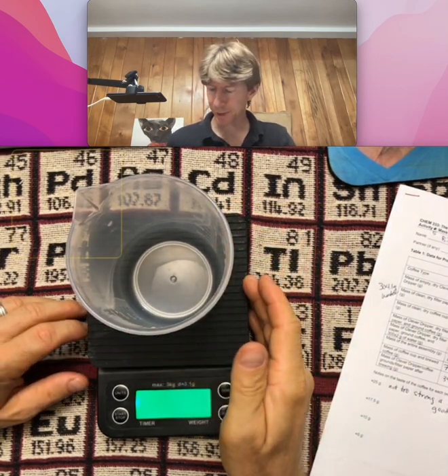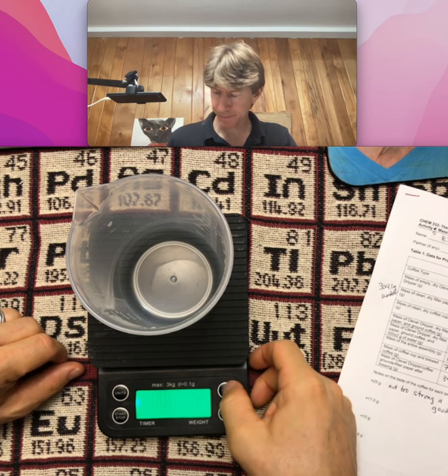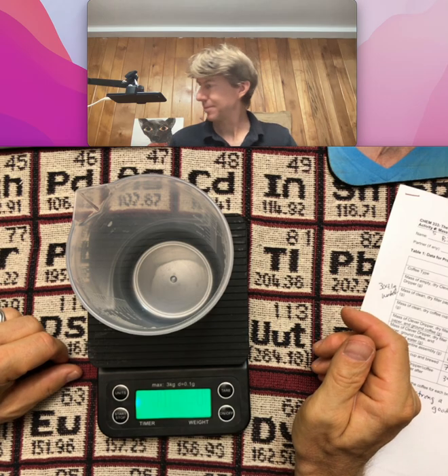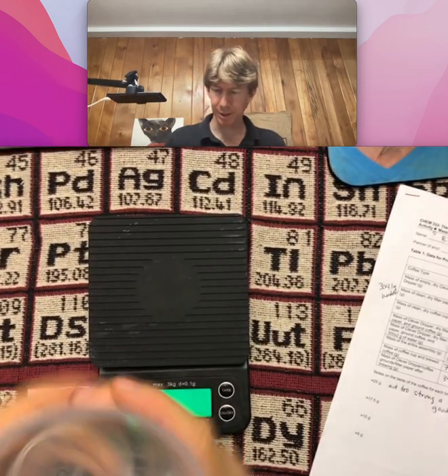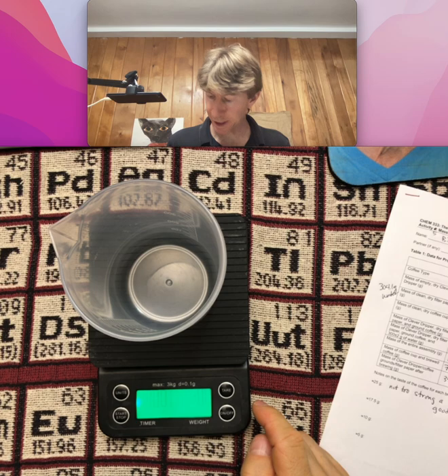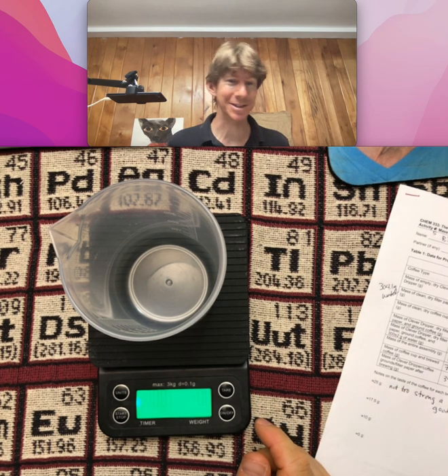This is hints number three. For hints number three, I'm going to tare a 500 milliliter beaker. That should be dry. Tare a 500 milliliter beaker. I just dried a little bit off and it still says 0.0.